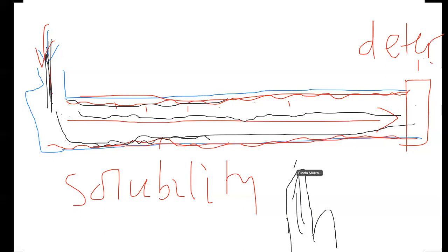Then you can tell. Once you see these two peaks, remember we said we can identify the types and the amount. So the types, how many, would be dependent on the number of peaks that display on the screen, of course being transmitted from the detector, and then the amount will be studied based on the interpretation of the peaks. Unfortunately, we don't do spectral methods of analysis, most of them, the IR, UV, and all that. But a partial interpretation of the spectrum, maybe we can look at it so that we have a full understanding. So that's how it's done.